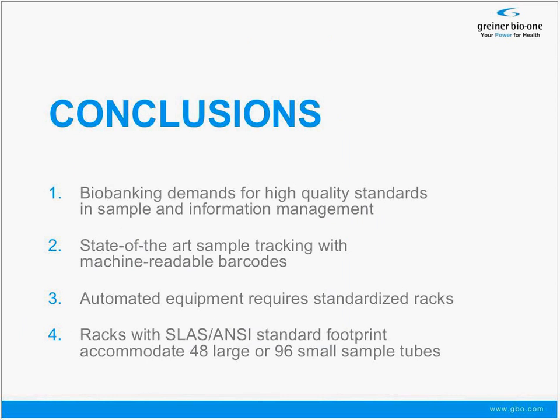This introductory portion of my presentation, I want to conclude here with a few key points. Demands for high quality standards in sample and information management. State-of-the-art sample tracking can be achieved with machine readable codes. There are automated equipment available and can be utilized for all kinds of processes in your biobanking approach and workflow.